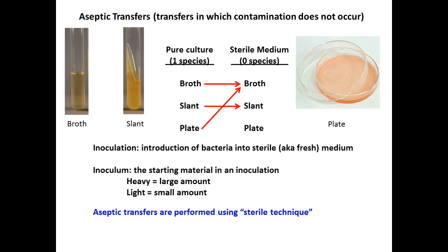Aseptic transfers are sometimes performed using sterile technique. This is sometimes interchangeable. For me, it kind of doesn't make sense, because sterile means what? No microorganisms. If you have growth, it's not sterile. Seems counterproductive. And some of the techniques we'll use in this lab aren't necessarily always employed. It depends on the circumstances.